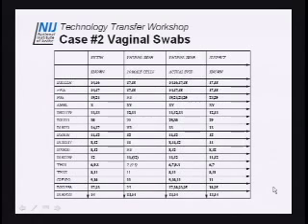Case number 2. The victim's known type is there. We have the vaginal swab, with 20 male cells collected. Again, these are not spermatozoa. With this, we've gotten almost a full profile from the suspect. Here's what we got when we did actual digestion of it, and you can see it was a wonderful mixture. At least it showed most of the profiles of both people together. But with the vaginal swab where we did the FISH, the XY chromosome paint, we were able to get a pretty decent profile. Again, this was done before we optimized the Identifiler amplification.